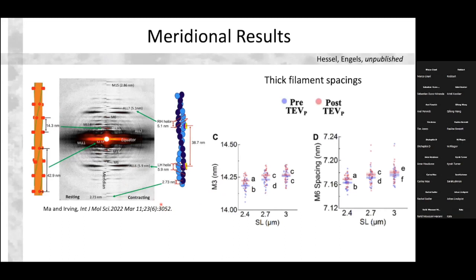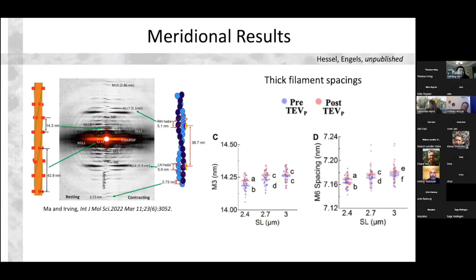But there could be, as I'm learning more and more about how changes in one structure of the thick filament can affect these different spacings and these different reflections, I'll just leave it at the point that we've noticed this change, but I can't tell you at this point what that's attributable to in particular, but it seems like a consistent finding.